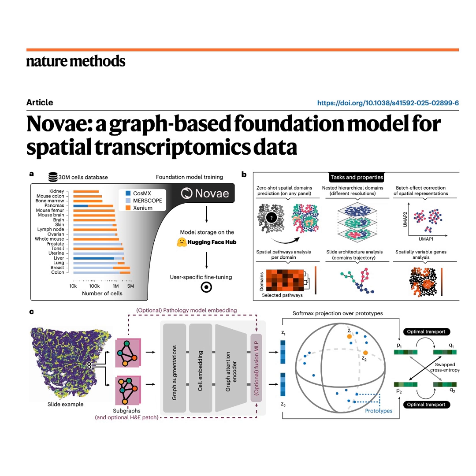Because D497 was enriched in regulatory T cells, or TREGs. Since TREG cells are known to suppress the immune system, the model is essentially showing us that patients with a good biomarker, the MGCs, are physically losing their local immunosuppressive environment. It links spatial organization directly to clinical prognosis. So that ability to connect location, cell type, and outcome, that's the ultimate goal of ST.